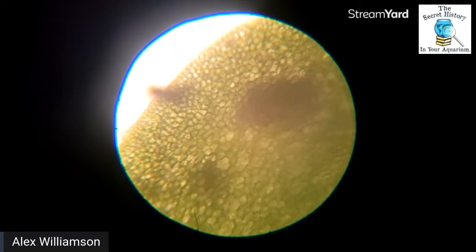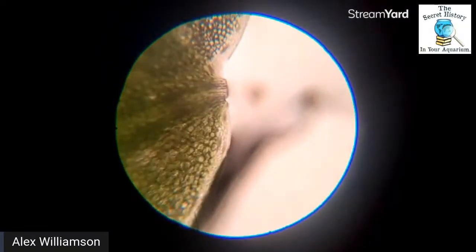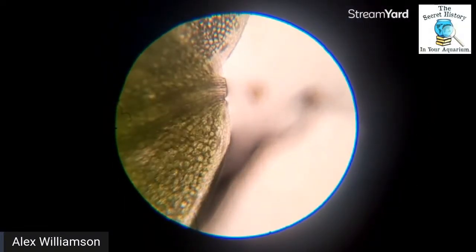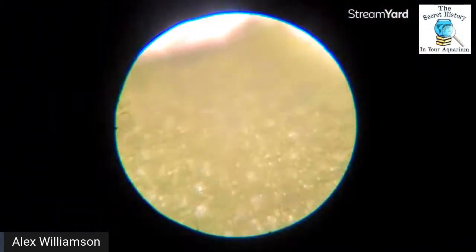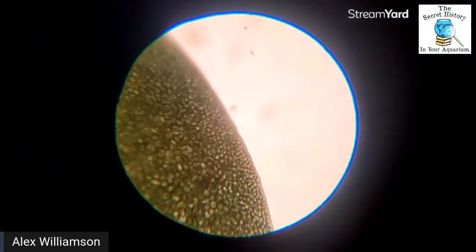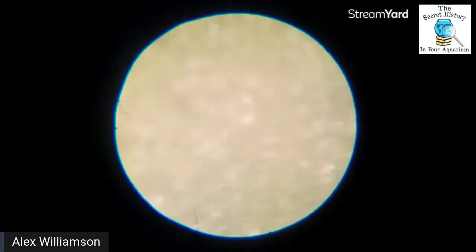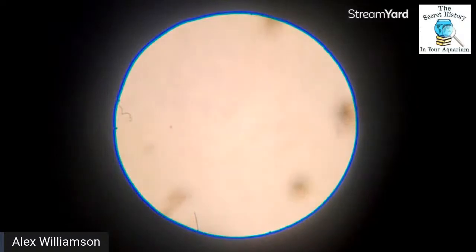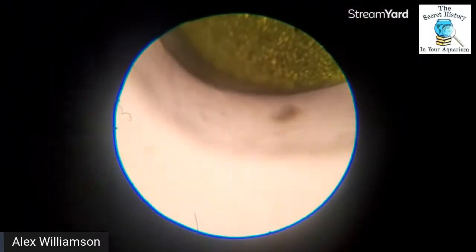Let's see if there's anything else going on with this duckweed. You can see the veins, which are hollow. That's the crease right there where the leaves part. And that's going to be where all the nutrients and vitamins and minerals flow. If you look really closely on the surface, usually you can see it's almost like shark skin, with a texture that repels water. And there are these tiny hairs on the surface that look like a cat tongue if you get even more zoomed in. I'm just trying to see if we can see the edge of them at a certain angle.